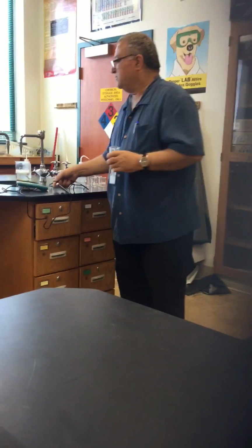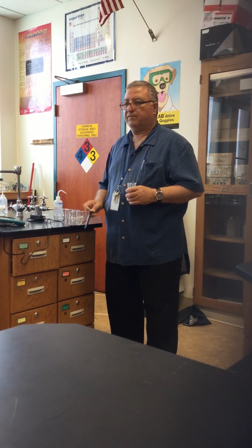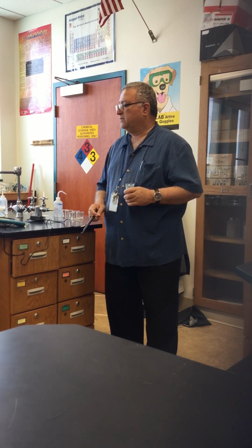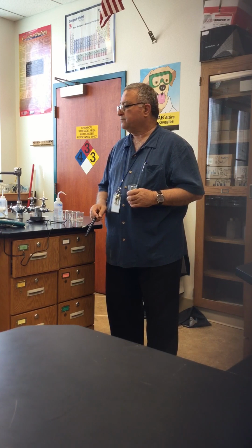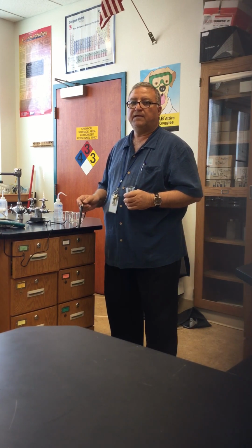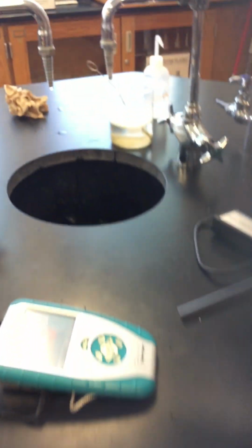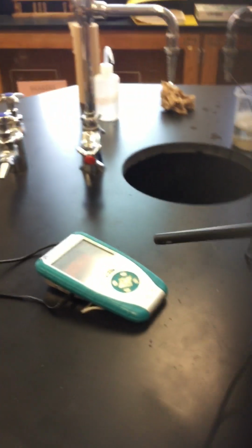Then we come here and we take our electrode. You want to take a look at the reading here before I put the electrode in. Can you see the reading? Okay, so 1.8, 1.6, right around there.